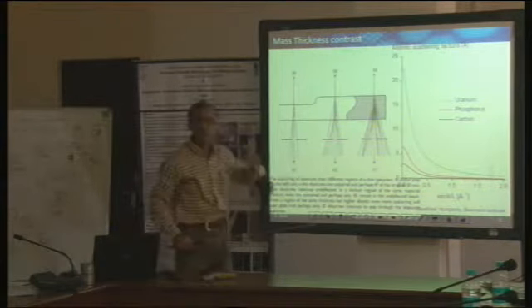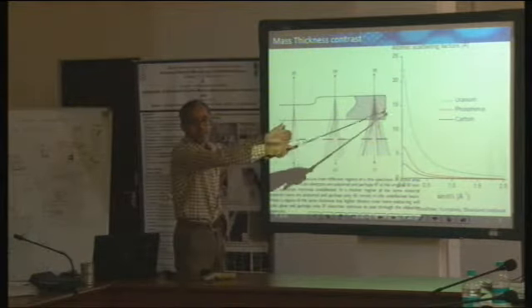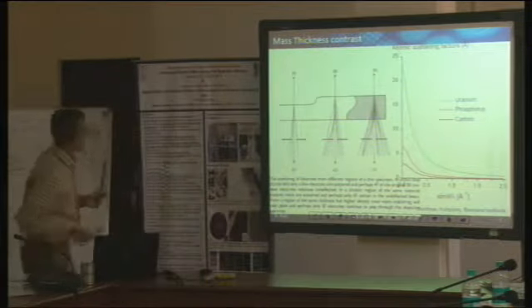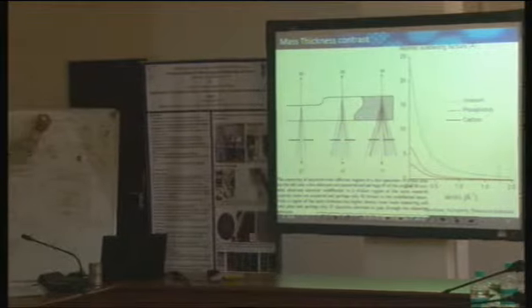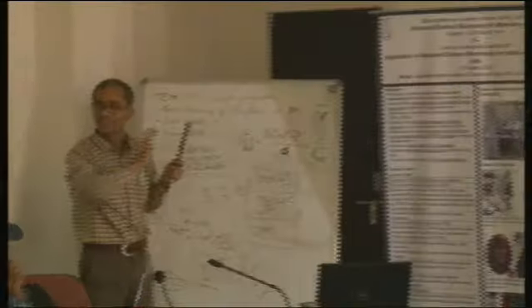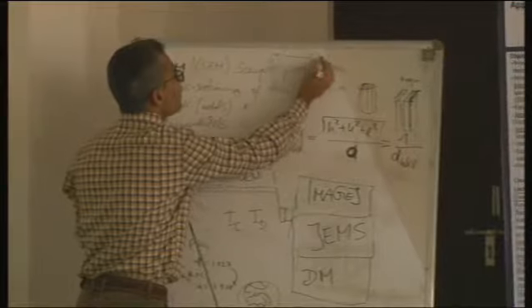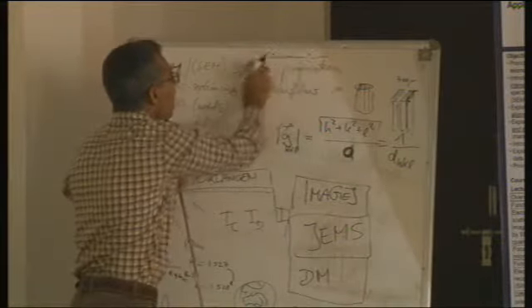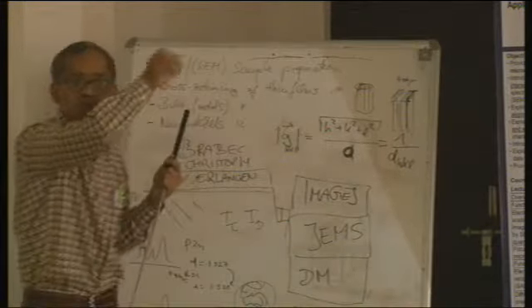Now I put my objective aperture. All of that ray, which was so big, has been confined into 3 spots, 1, 2 and 3. Is this clear? And I put my objective aperture here like this. The other two beams immediately got blocked, and only this one managed to pass through.